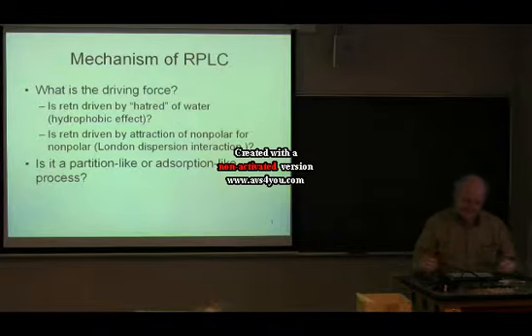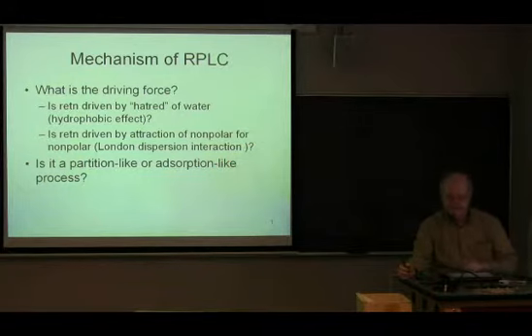And there's a lot of stuff involved here that I hope you will appreciate being of a rather general nature. Not just chromatographic, but understanding mechanisms in chemistry in a general way. But I think reverse phase liquid chromatography is a sufficiently important topic, as are things related to it, that this is worth understanding. Roughly half of the lecture will be on this, and then the rest will be on an introduction to normal phase liquid chromatography, which is the exact opposite of reverse phase.